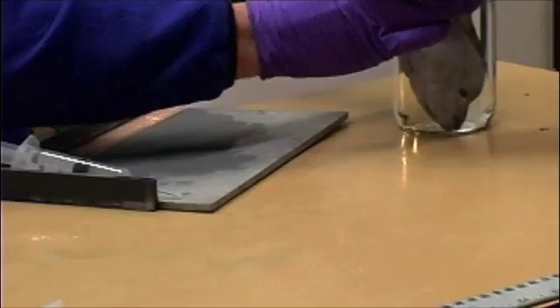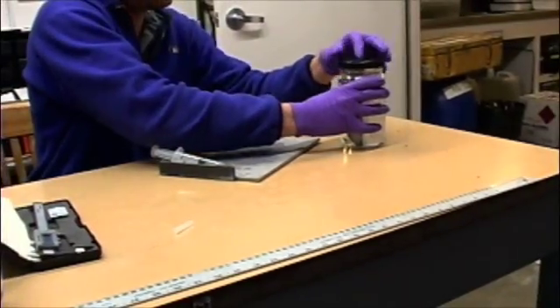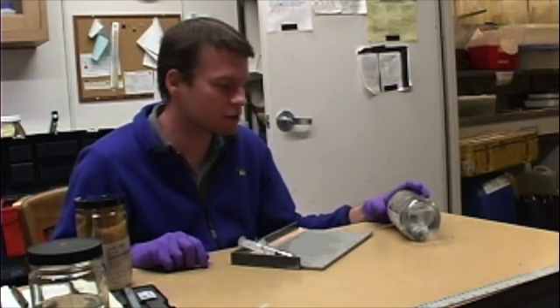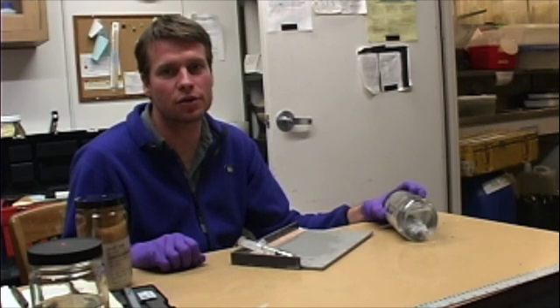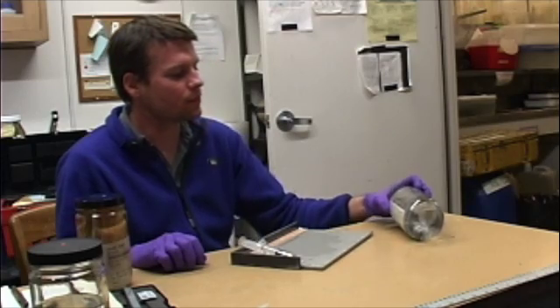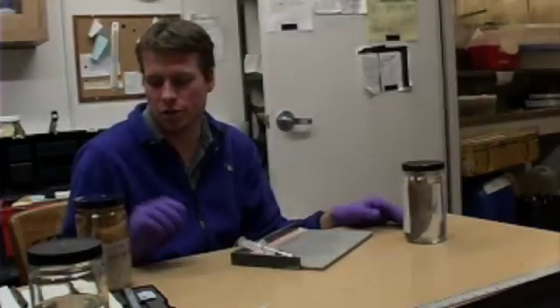So I just drop it in. Now it's in formalin, and it will fix in this formalin for a week. Then we'll wash it off and soak it in 35% ethanol for another week. After that, we'll put it in 70% ethanol for permanent storage in the museum.